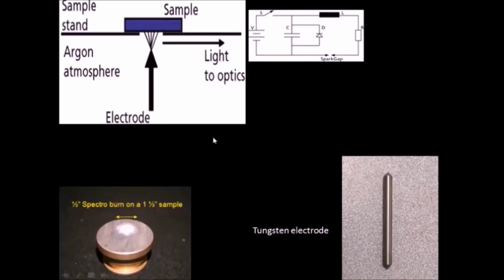In the case of metal spectrometers, the spark is generated between the metal sample to be tested and the tungsten electrode through an orifice of 0.5-inch diameter. Normally in railways, we use spark or discharge type excitation source.